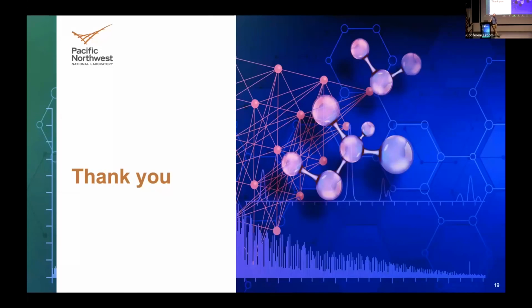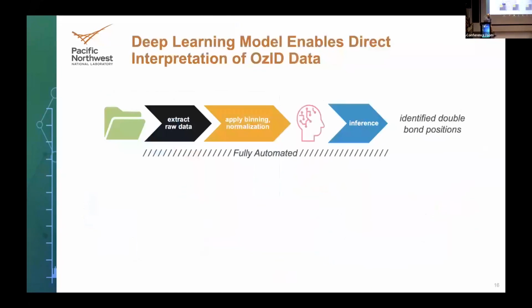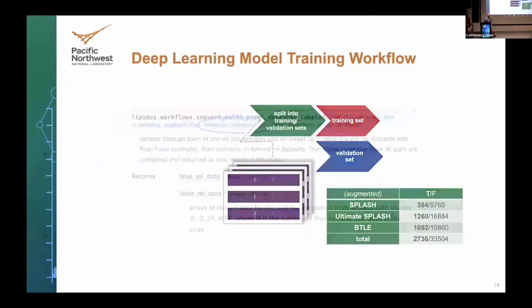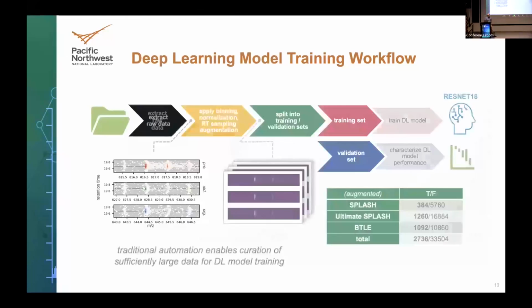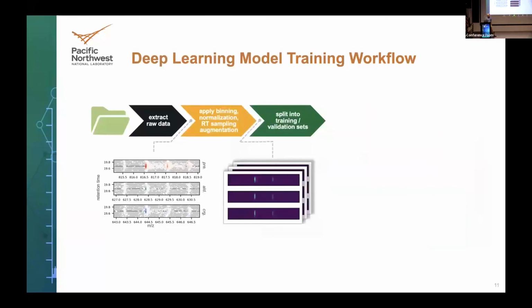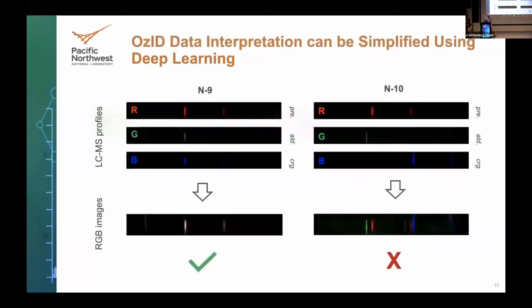Thank you. And also, one last question. You didn't mention too much about how good your model is, which can also depend on which kind of feature you're looking for, right? Yes. So what feature or what other parameter are you actually using?